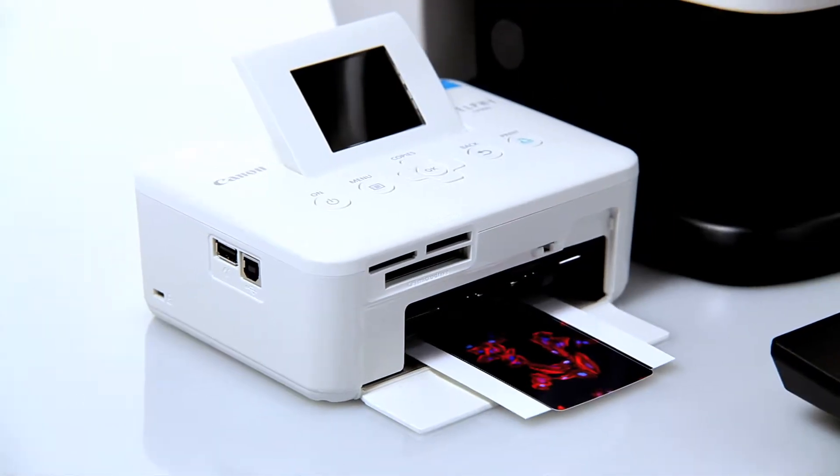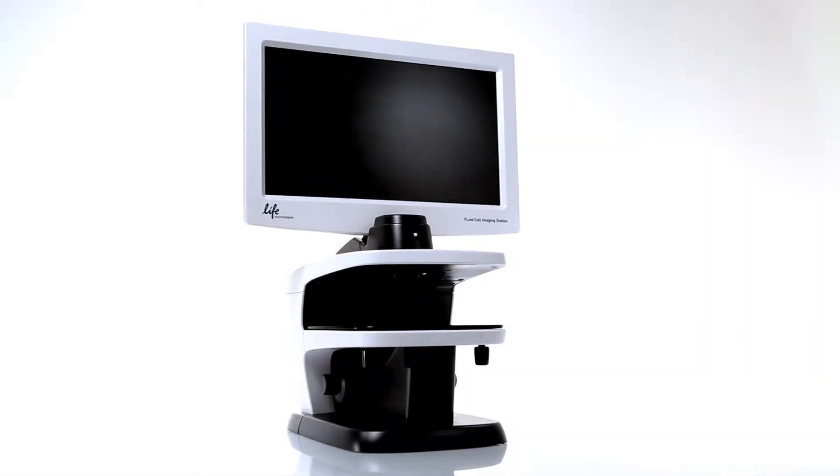You can take a student who's never done fluorescence microscopy and give them a slide and say there's three colors on here, go at it. They are so intimidated by old microscopes and how they work, they almost don't want to start. The first person to use it was my 15-year-old son at my kitchen table — a prototype — and he had images going within 45 seconds.